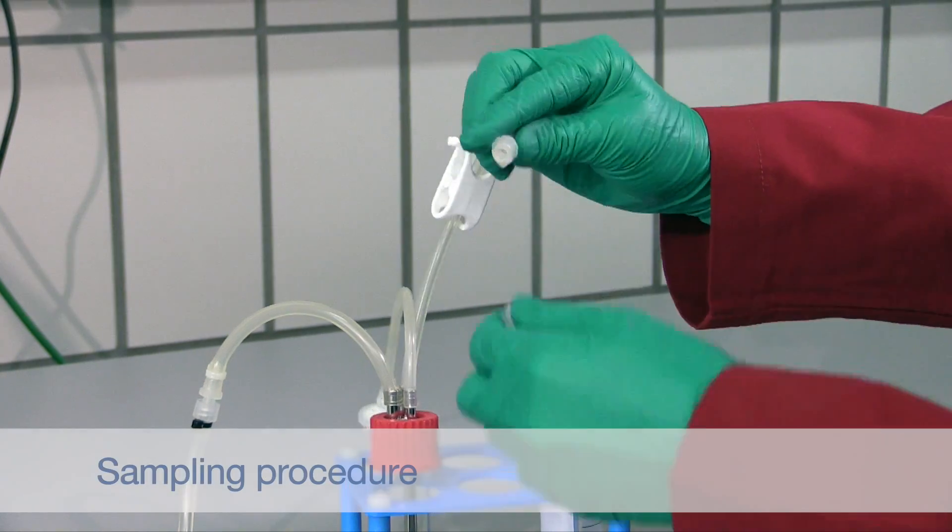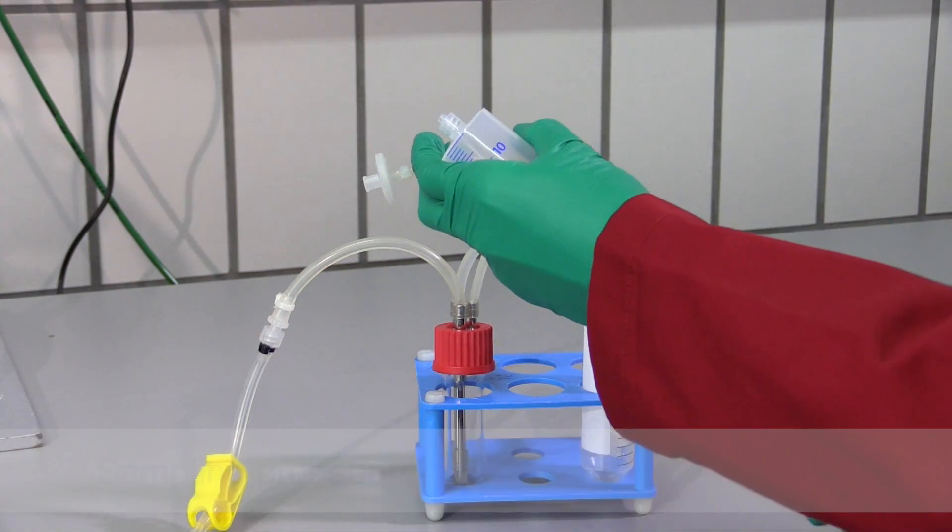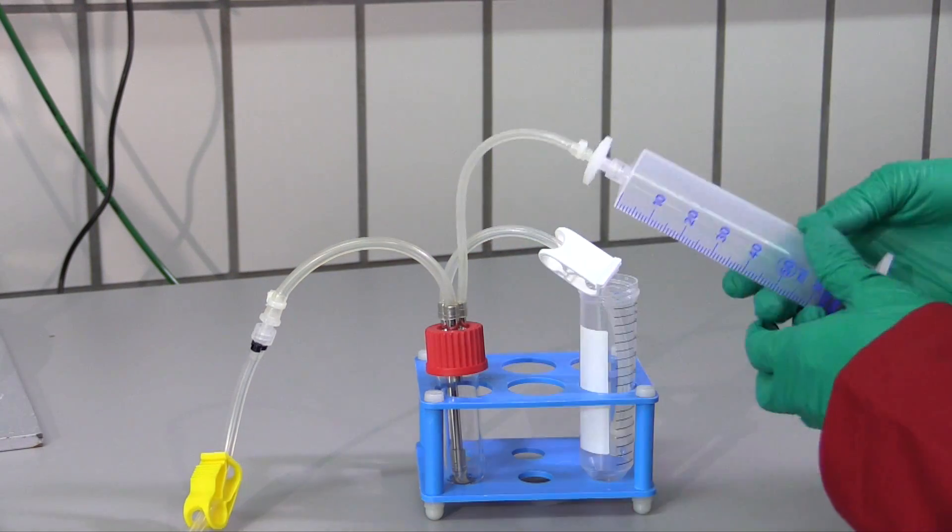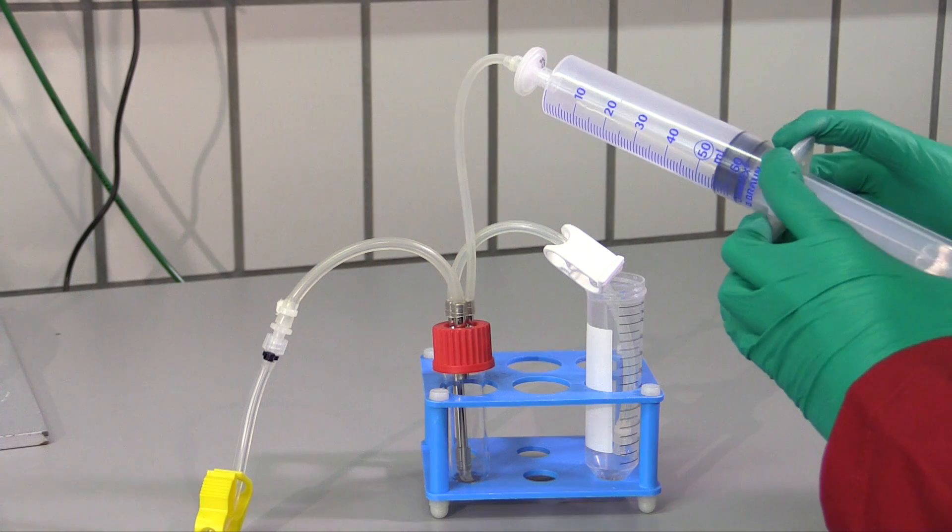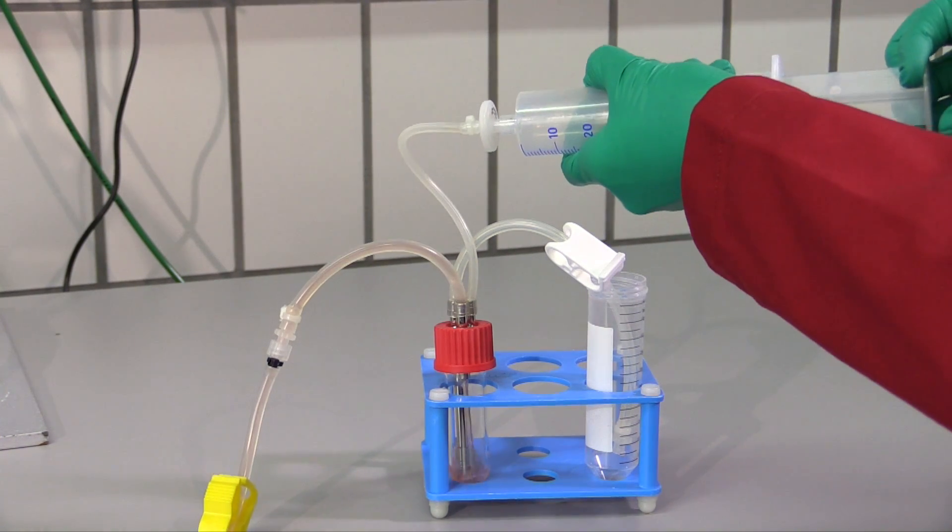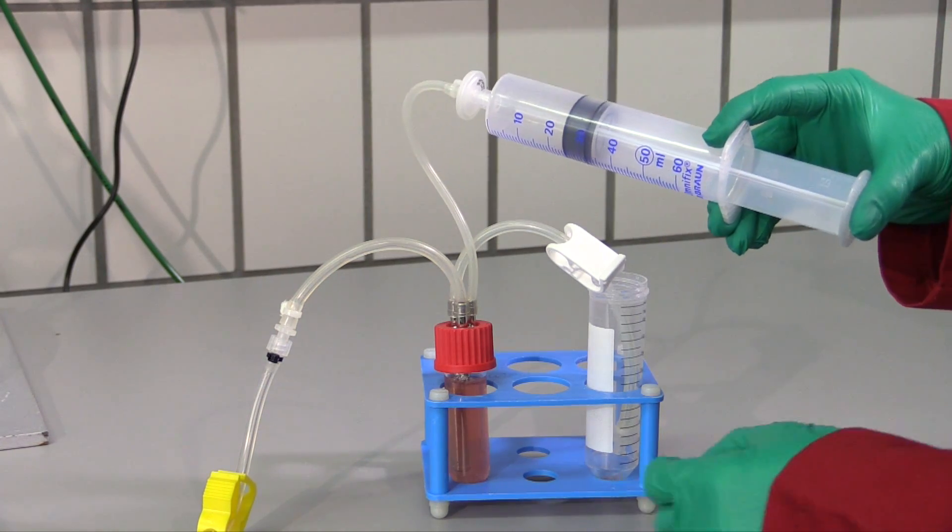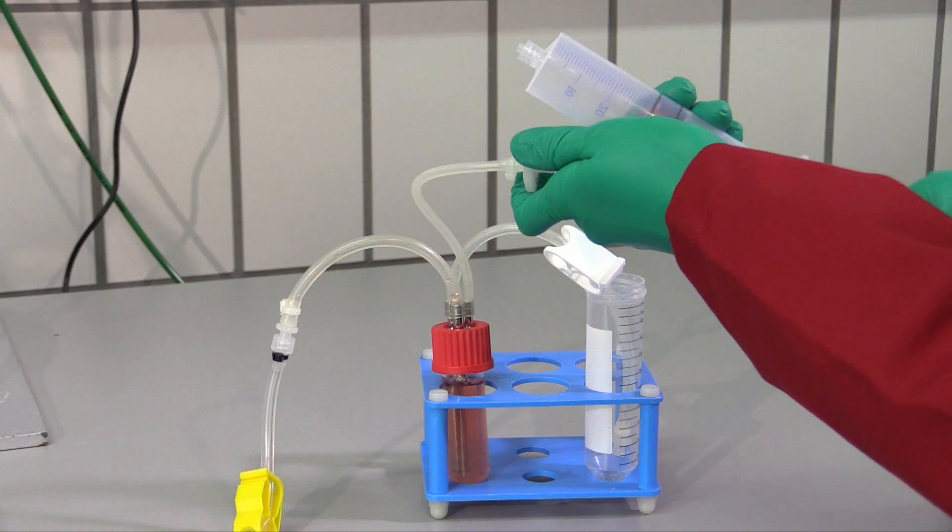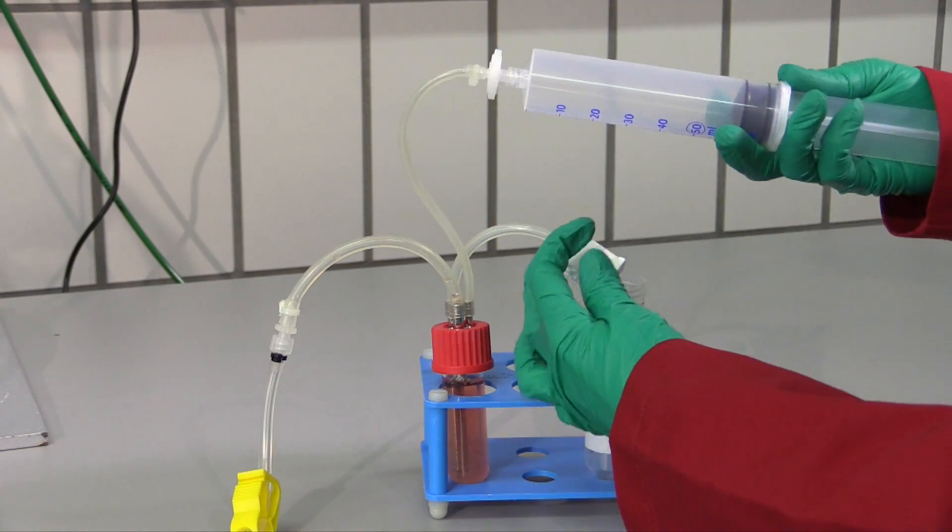For sampling, an external sampling device is used. A 50 ml syringe is filled with air and connected to the air filter of the sampling device. The clamp on the tube connected to the bioreactor is opened, the syringe is exhausted, and the microcarrier cell suspension immediately drawn up until the sampling device is completely filled. To transfer the sample from the sampling device to a falcon tube, the second clamp is opened and the syringe exhausted again.